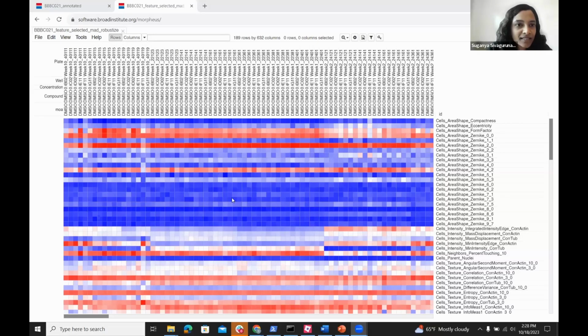Okay, sorry, was it from feature selection or normalization? I would like to go over it again. Sorry for the inconvenience. There's a lag in the process that I do, and it is being displayed on the Zoom. I will go over the feature selection again.